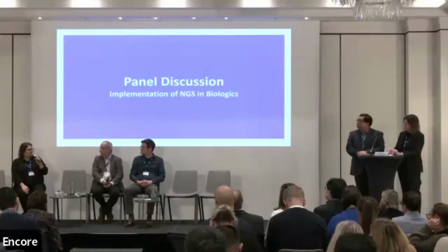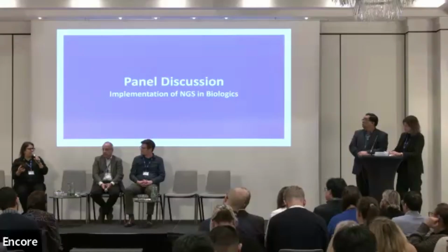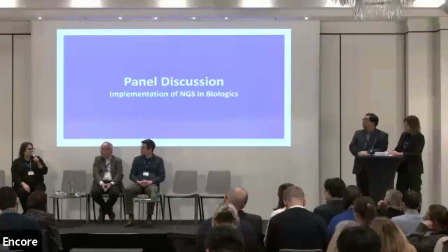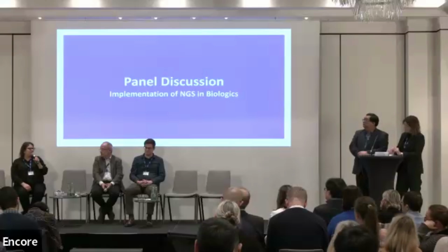Yeah, I'll echo that as well. When it comes to the risk assessment and choosing the kinds of samples and all of that, it'll still remain the same for us. But then, like Robert mentioned, obviously the sequencing part and all of that will need to be updated.